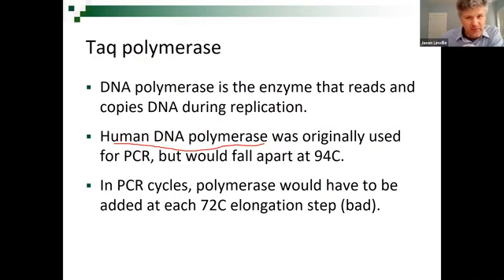The DNA polymerase would fall apart, the DNA would split, cool it down, the primers attach, heat them up to 72, and have that student open up all the tubes, squirt, squirt, squirt, squirt, squirt, all of the polymerase. They would have to sit there for like 3 hours, and 28 times they would have to open up the tubes and squirt in the polymerase. So it was a very time-consuming process when PCR was first demonstrated.